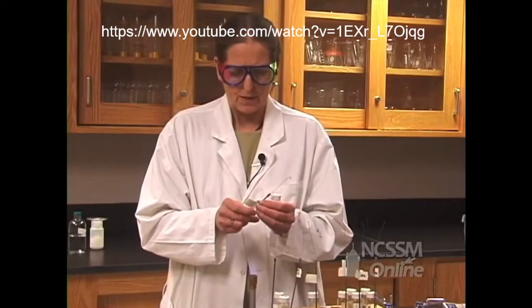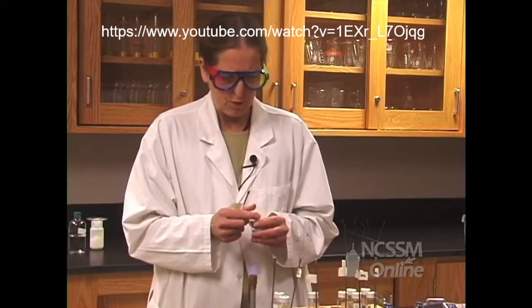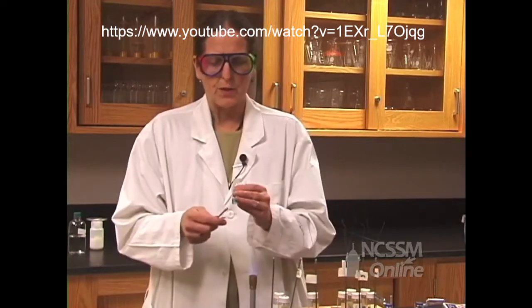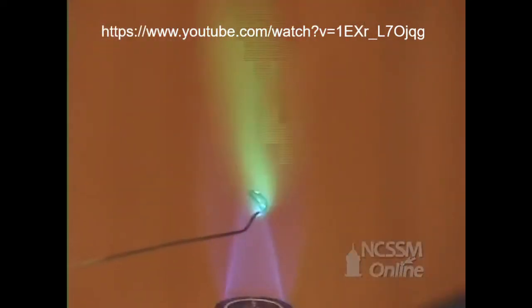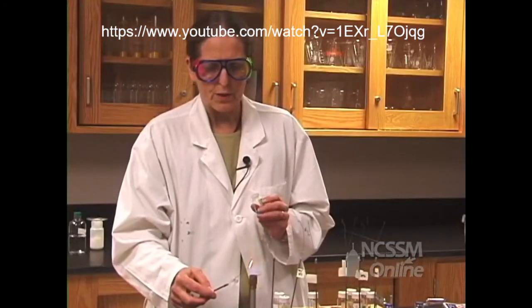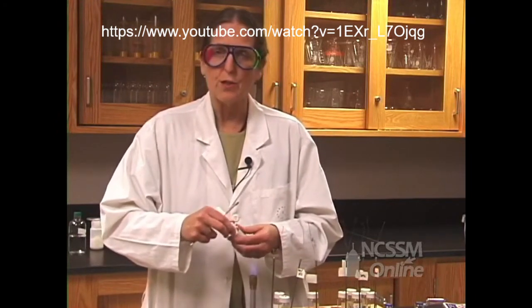We're going to do a flame test on a number of selected compounds, primarily group 1 and 2 ions. These are aqueous solutions, and we have just an inert metal loop. We're going to dip the end into the solution and put it into the flame. That excitation characteristic color is like a fingerprint for an element. So we're going to look at a number, and then we're going to ask you to identify some unknowns.